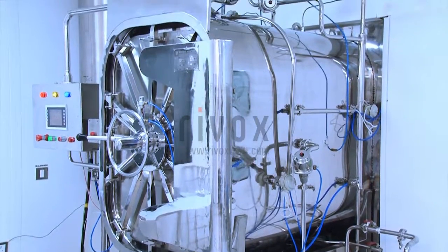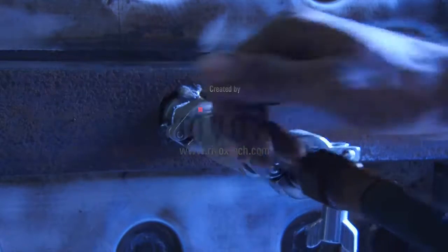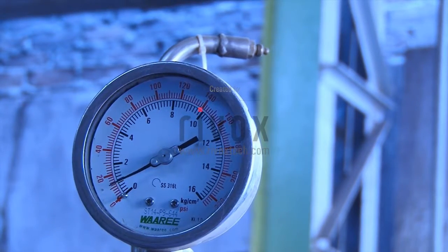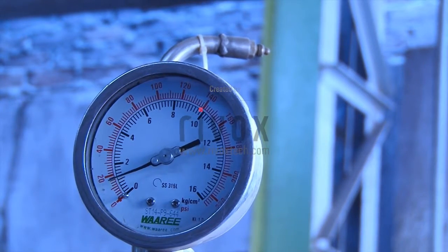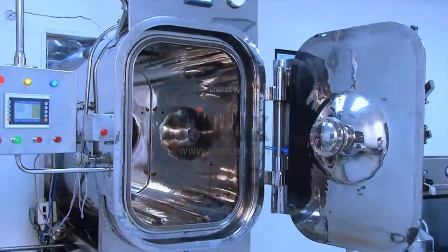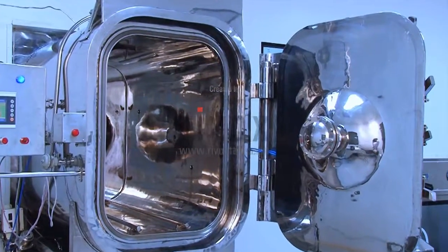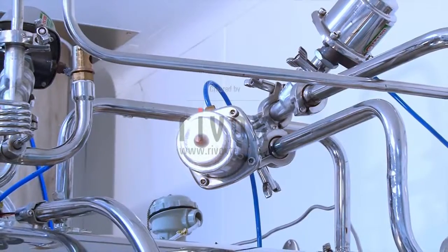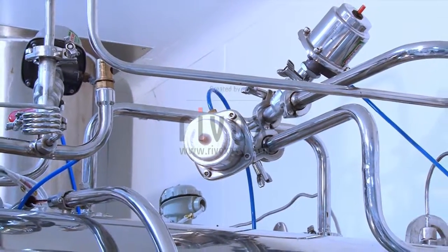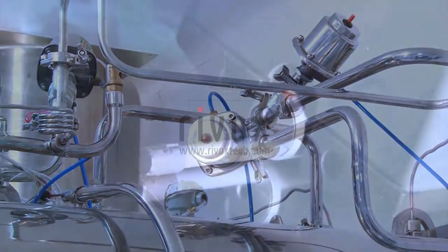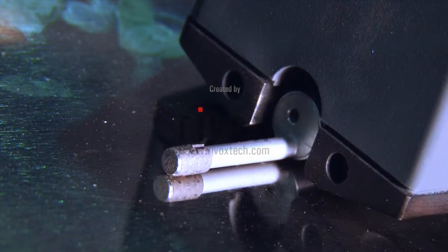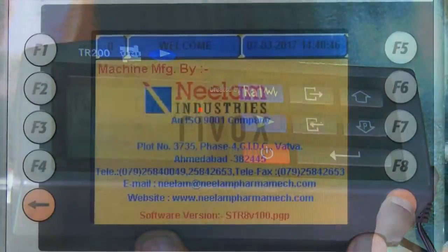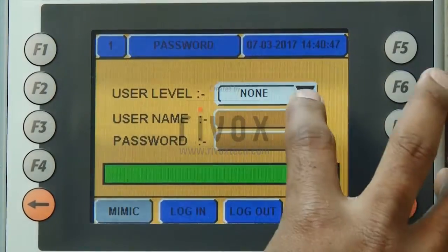The system provides automatic computation and printing of all temperature sensor, pressure, F-zero value, and minimum and maximum temperature during sterilization hold. Safety features include chamber, jacket, and process pipelines that are hydro tested, and a door safety assembly with rupture disk.